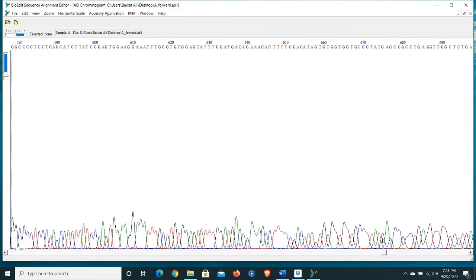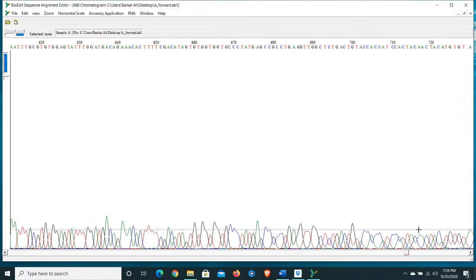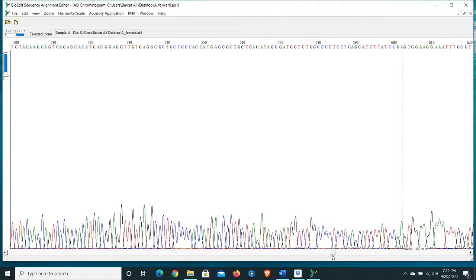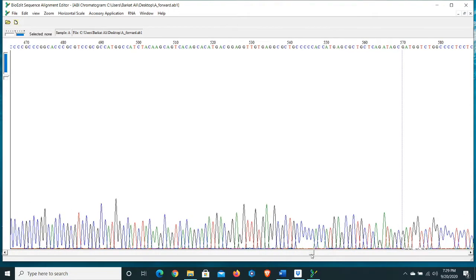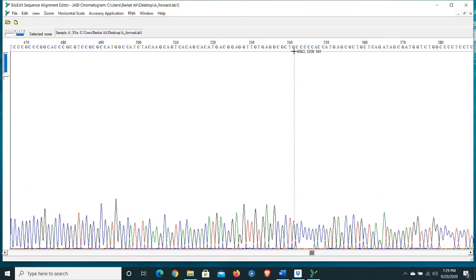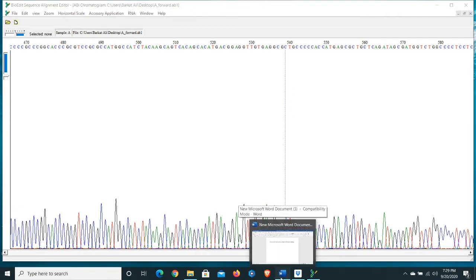You can assess your sequence for contamination and any ambiguous bases. Let's scroll to the right-hand side to see the end of the sequence. You can see clearly these are not good bases. Up to this point our sequence is good, so note it — it's important you note the position of bases you want to edit later.